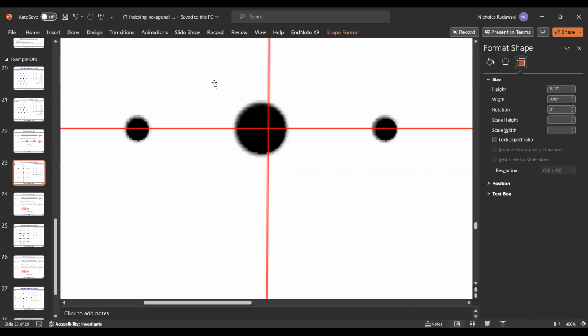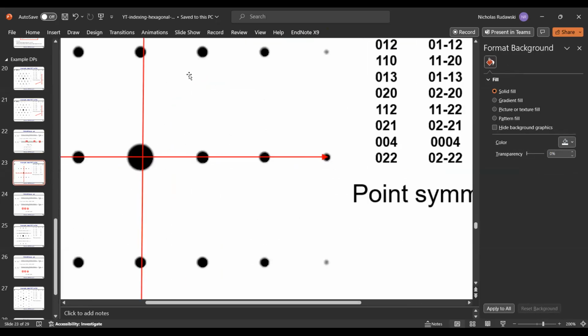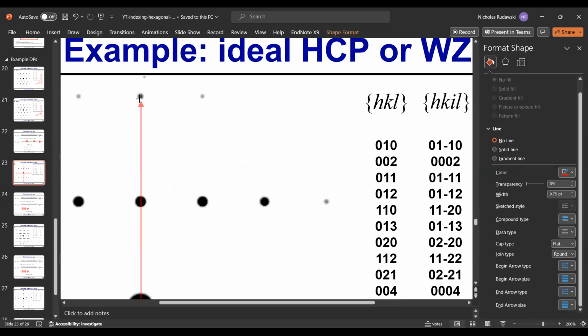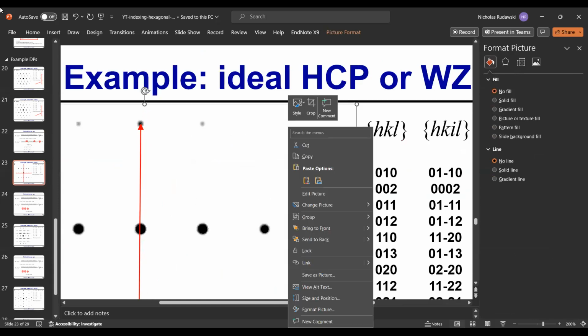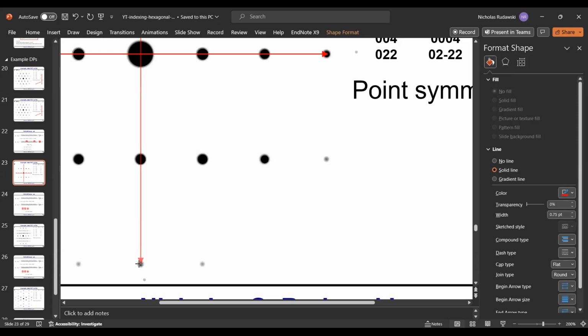Cat is still in my lap. So hopefully that's good news. Okay, come on. Where are you? I'm hoping I don't run out of battery here. I shouldn't. Is that close? Oops, mouse is on the floor. Sorry, let me grab that. Okay. This is clearly a little bit off here, so we'll just have to make do.